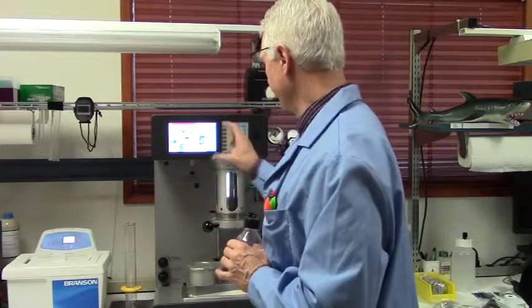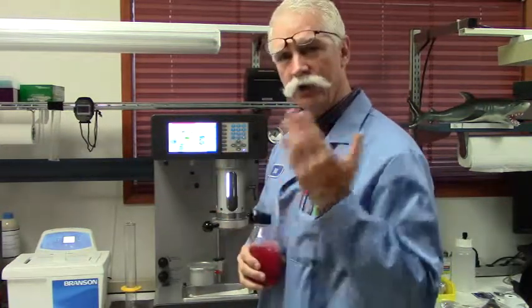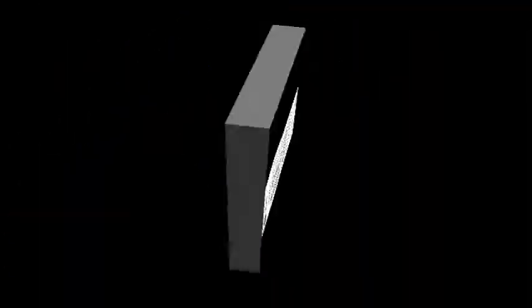When you're done, take the results from the printout or from the screen and compare them to your count cert. Being within about 10% across all channels is a good indicator that the instrument is still calibrated properly and that you're good to take your measurements.